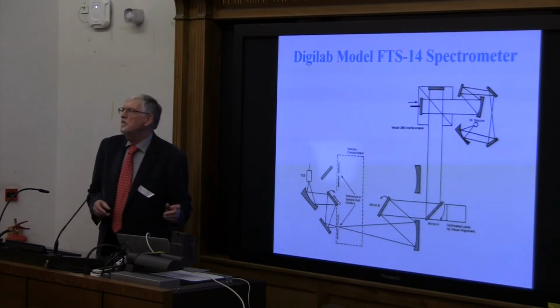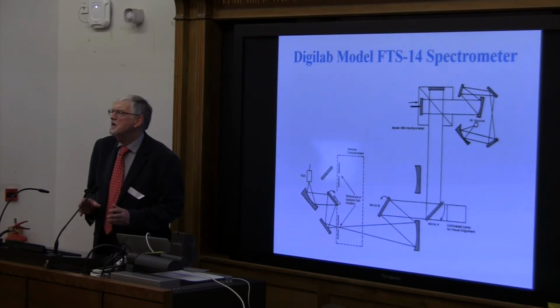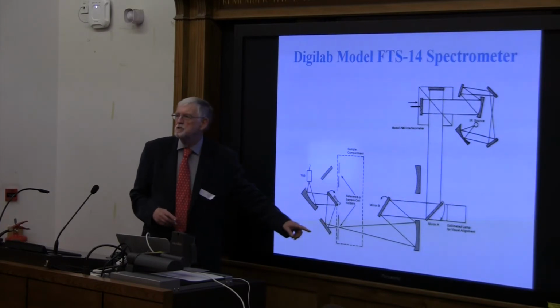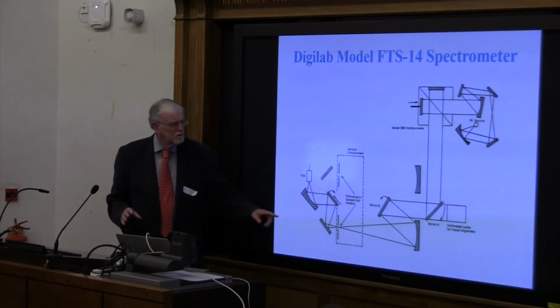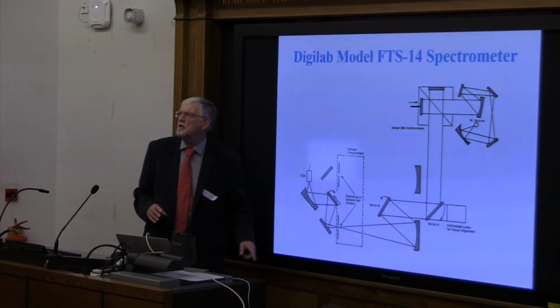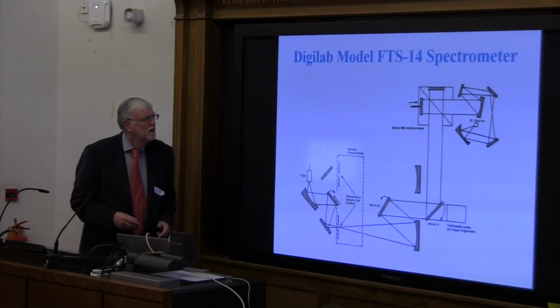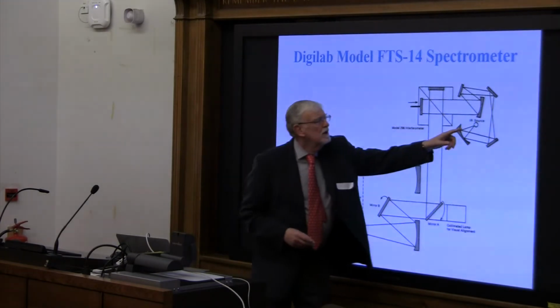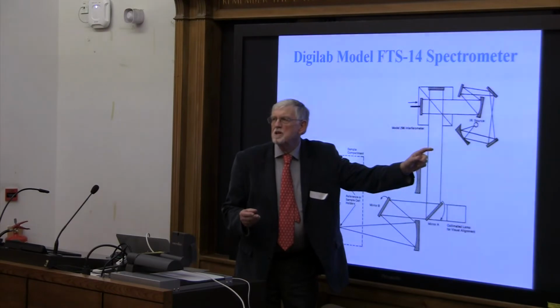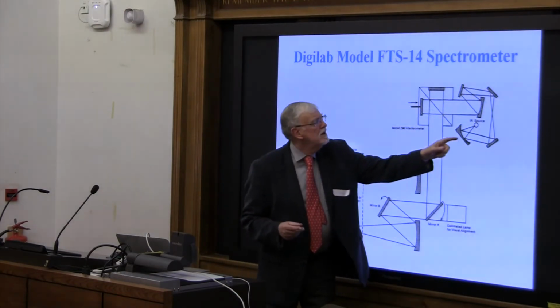The design of the optics was meant to replicate the design of a standard grating spectrometer at the time. So it had a side focus, which no instrument has now, and that was probably a mistake, but it was designed to take accessories that would fit into the standard grating spectrometers of the era. So you had basically an IR source, standard IR source, similar to what we use today. In fact, the first one was a nichrome wire source, but they very quickly went to Globars.